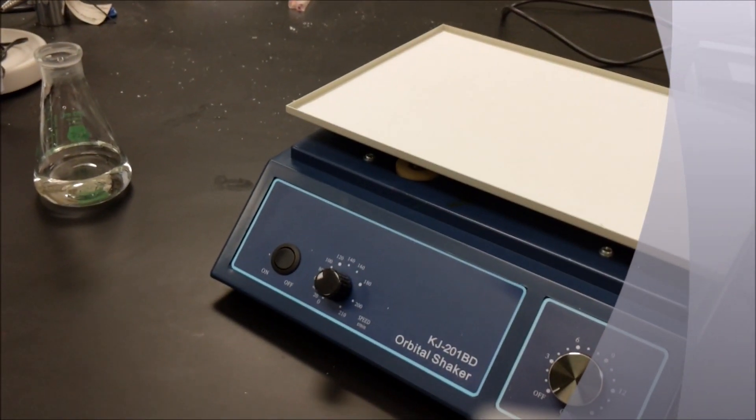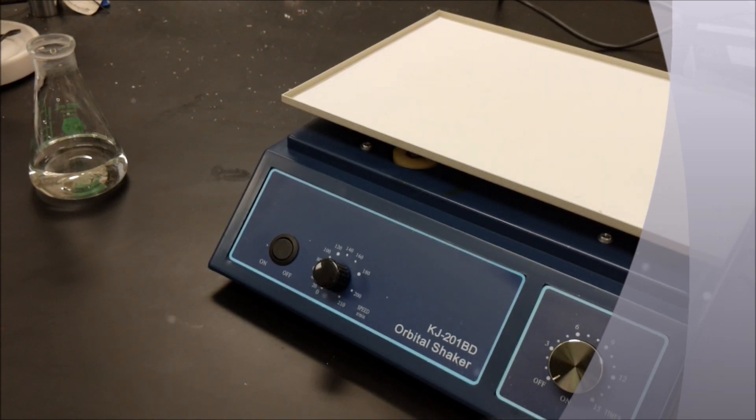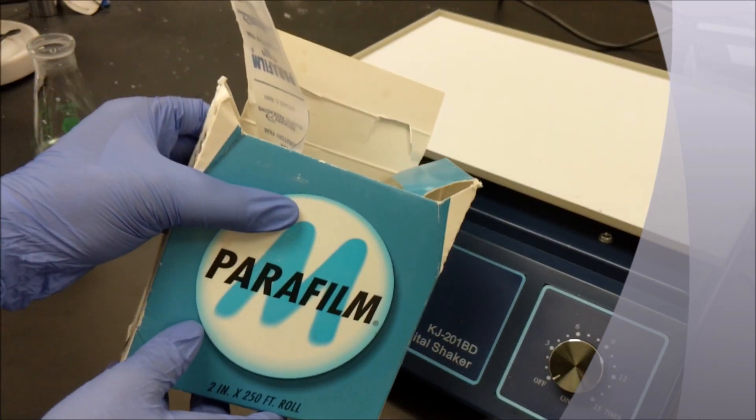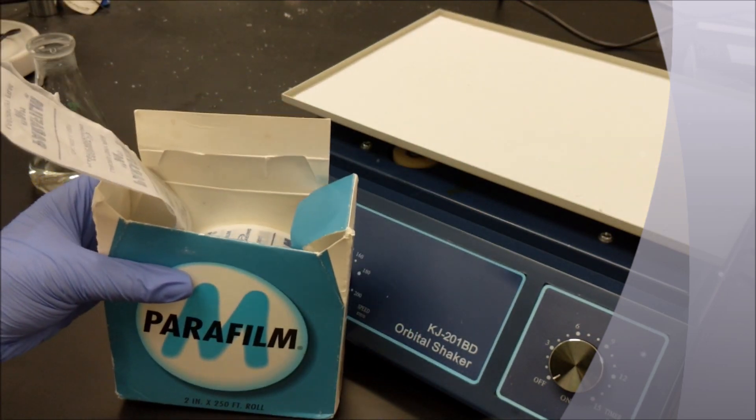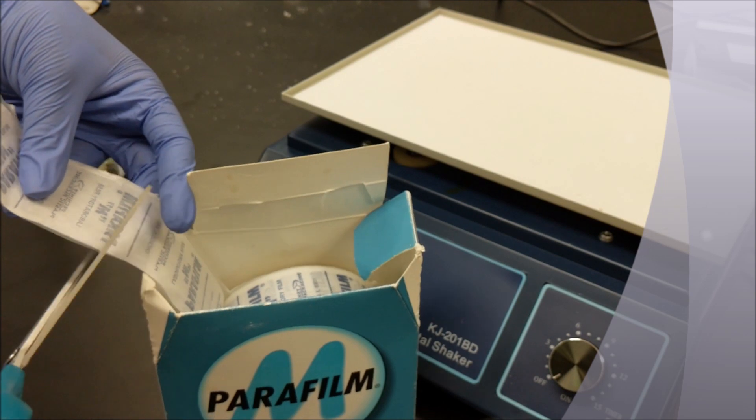Before you add any solution to the shaking platform, you must properly prepare the flasks. To do this, begin by grabbing a parafilm strip from the lab and cutting about two square lengths from the parafilm.